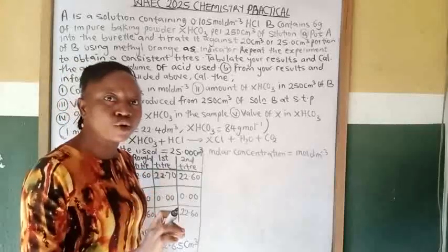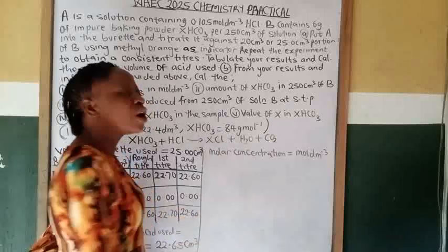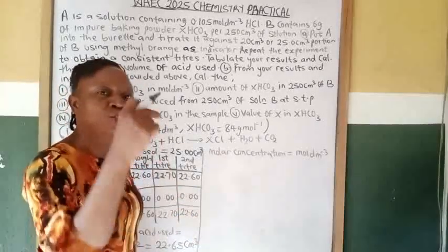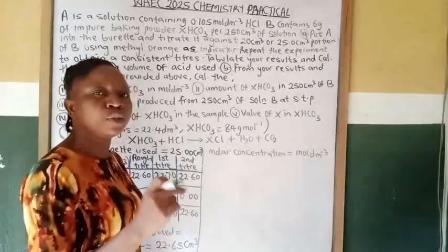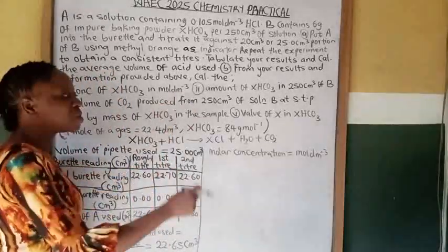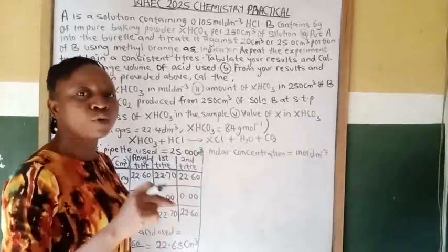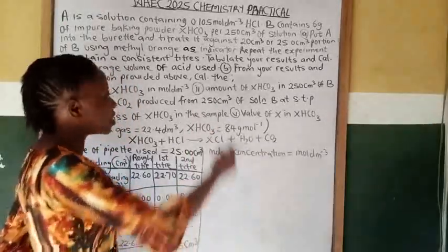It can either be the molar concentration of acid or of base, and that will be stated in your question.